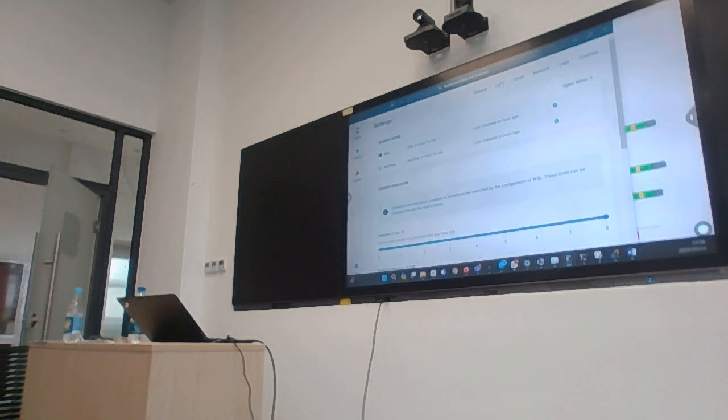Can you open the shelf for me as well? Just open the shelf, but yeah, the issue is... and I'll install Docker for you while you're away. What did this one say? Busy installing.